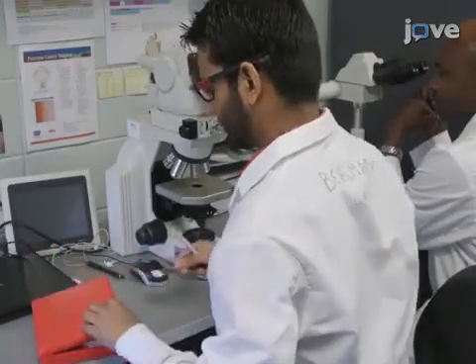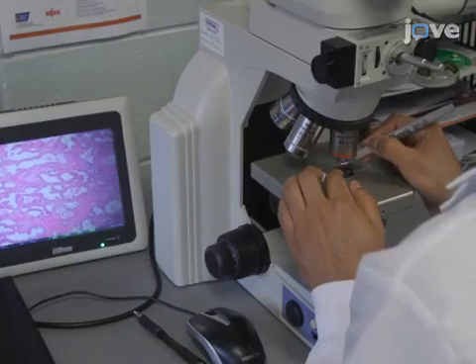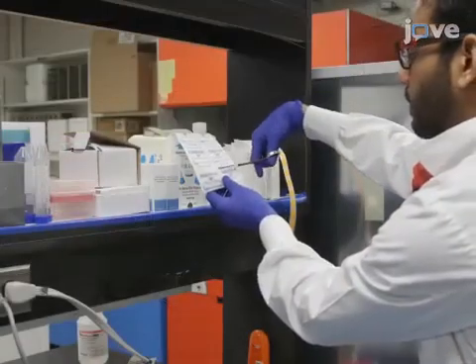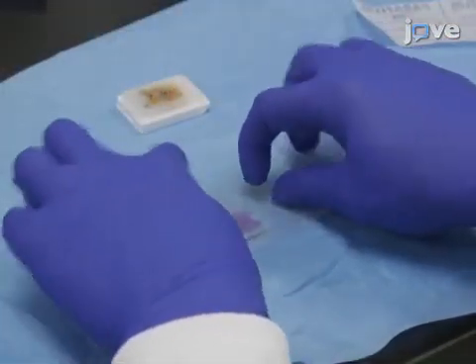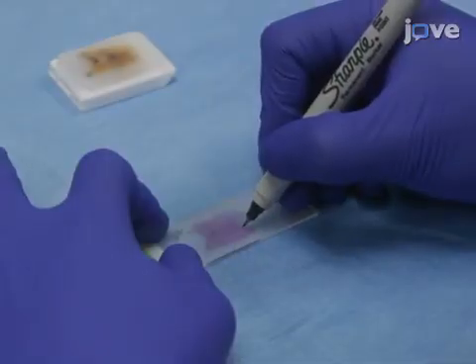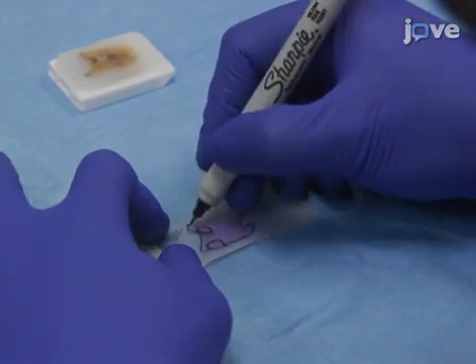Begin by reviewing the microscope slide and outlining the region of interest using a fine point permanent marker. Next, cut a section of paraffin film large enough to cover the region of interest on the microscope slide. Then, place the film firmly onto the slide, wrapping the film over the edges to keep it from slipping. Using a fine point permanent marker, outline the entire tissue and the region of interest within the tissue.